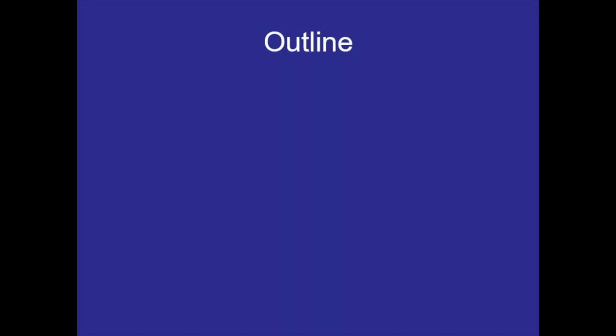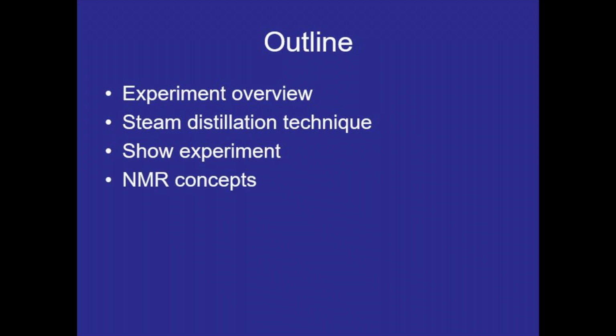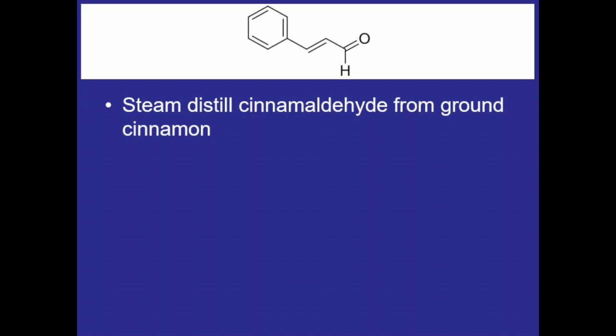Here's the outline for this video. I'll be going over the experiment in general, focusing on the steam distillation technique. Then I'll show the experiment in the lab, and at the end I'll be going over some NMR concepts. In this experiment, we are going to be steam distilling cinnamaldehyde from ground cinnamon, so I'm going to spend some time going over that technique.